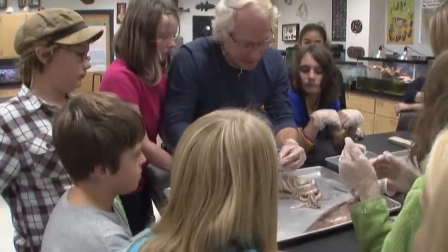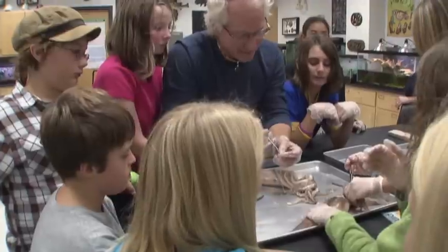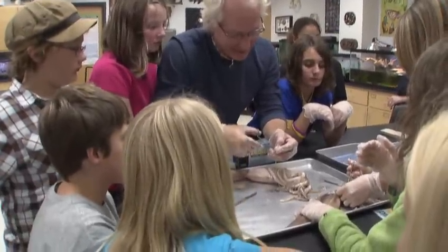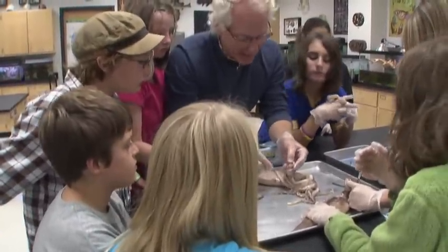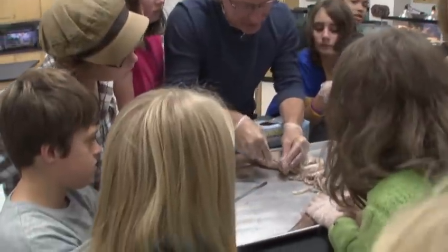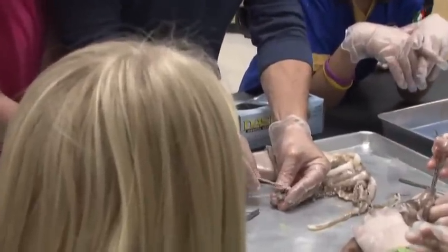It's really hard to hang on to this animal, so you guys have to excuse me here. How's yours coming out? Can you get yours? I just stuck my finger in it. Can we hold it? Yeah, that's what I'm going to let you do. See how big this beak is? Now, here's what I've got to do. The radula is back here, so I've got to pry in there, which is hard because this beak is really sharp. I don't want to get poked. I just want to pull it out.